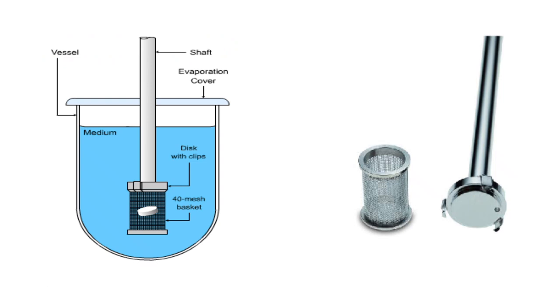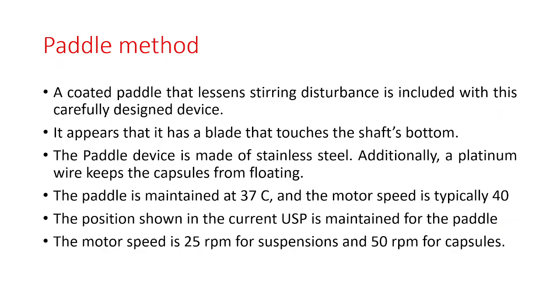And this is the apparatus. You can see here the rotating basket is placed along with the shaft, and here the 40 mesh screens are present in that basket, and inside you can find the tablet is placed. And here we have taken the dissolution medium in this vessel.